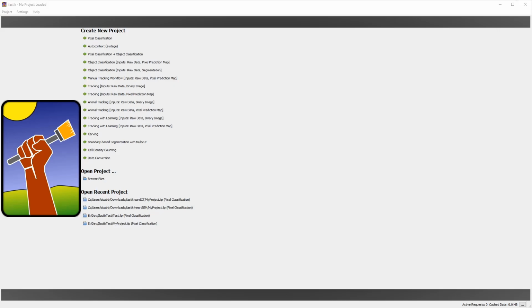So far, we've seen the different segmentation tools that Avizo has to offer. And in most cases, these are sufficient to perform good segmentation. However, in some situations, you might be interested in trying out a different tool in order to improve your results, or you might simply not have access to Avizo.